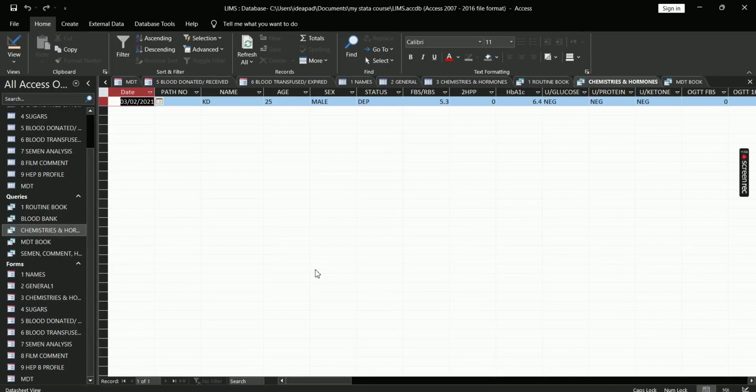So this is a template of what I designed for a facility. And if you would want to adopt it at your facility, there is that option to do that. This will be made available. And if you want this to be designed to suit your facility's data capturing needs, of course, that arrangement too can be made.